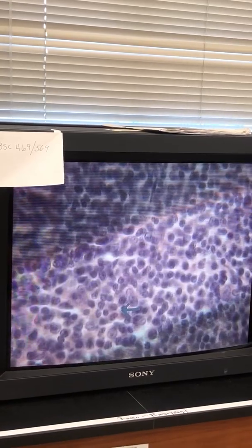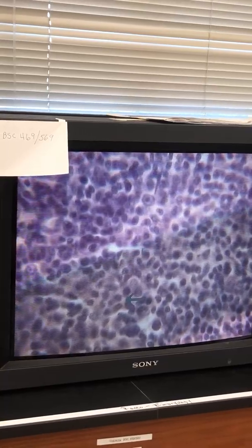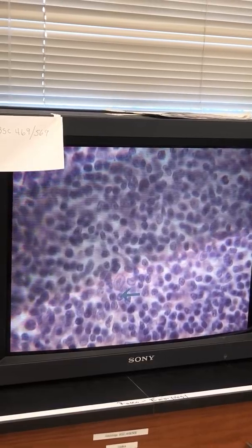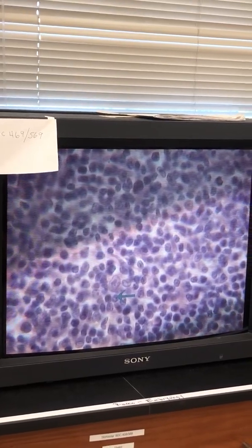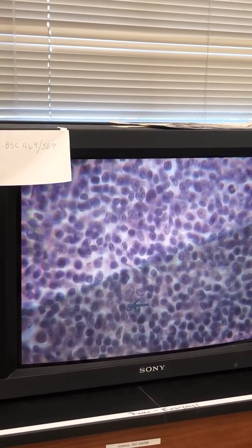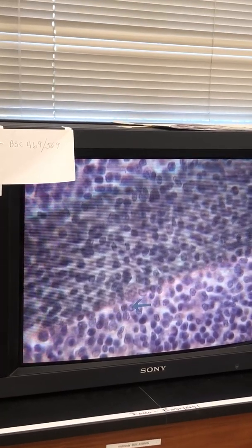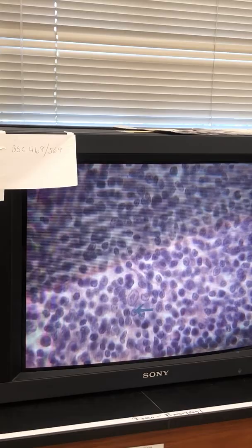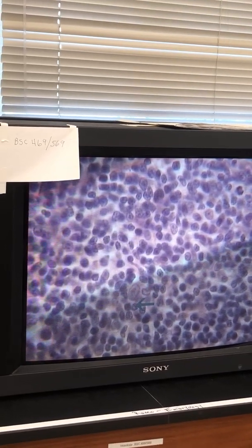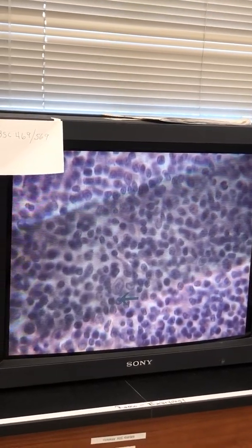Now, somewhere in this paracortex, you should be able to see a postcapillary venule. I was telling Maggie how you identify a venule: it doesn't have hardly any muscle around it, and postcapillary wise, it's not muscle. Most of the time it's lined with endothelial cells that are normally bumped out, but not very much.